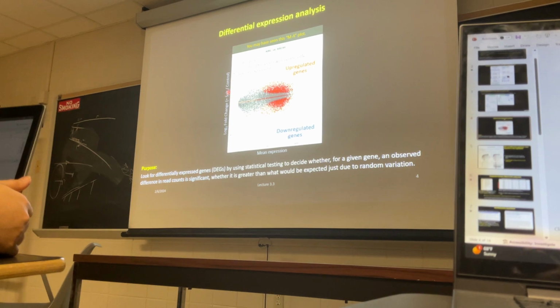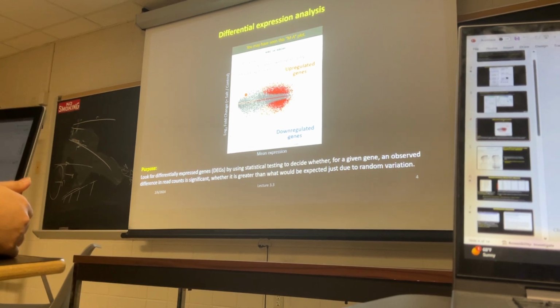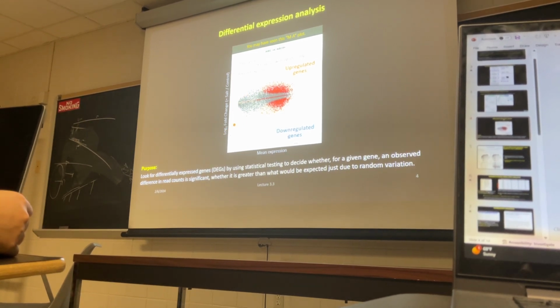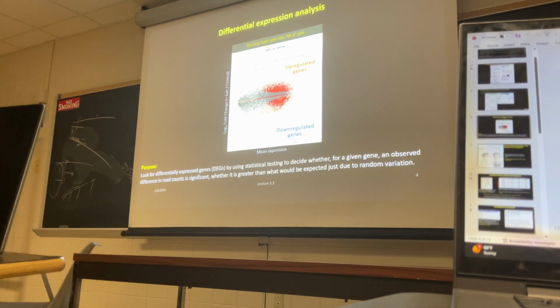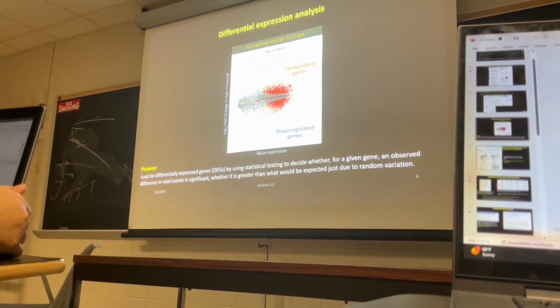So for that gene, the expression of that gene under salt versus the control condition. And then if the fold change is positive, this is in the log again. That's why positive means the higher expression upon salt. And when you have the negative log, that means down-regulated. So this many number of genes are down-regulated, and this many number of genes, all these red dots, are up-regulated upon salt stress here. That's what it means.